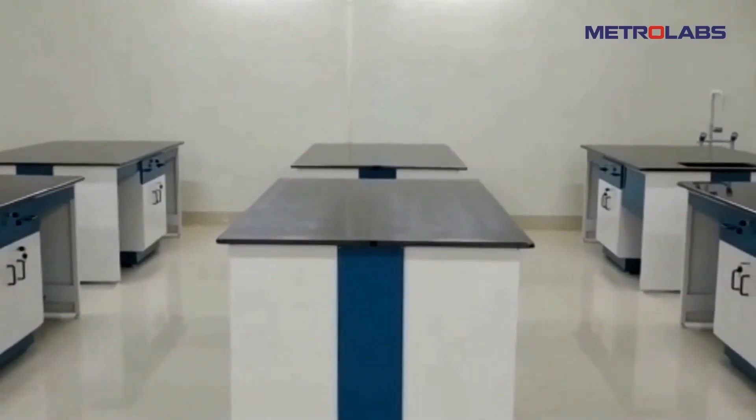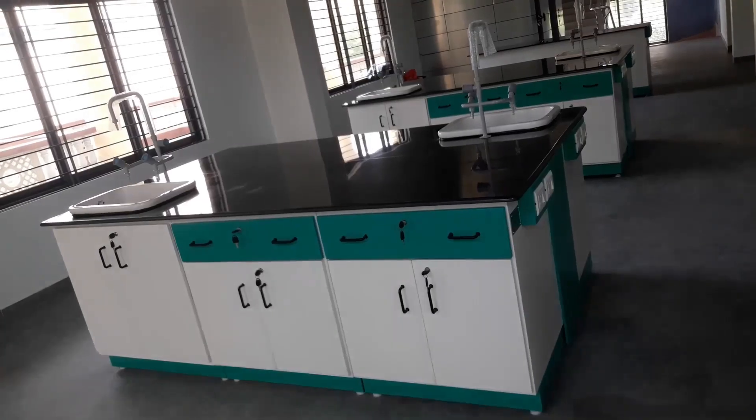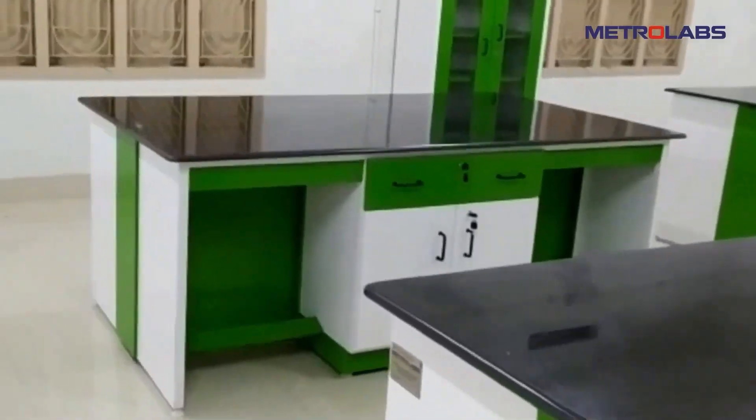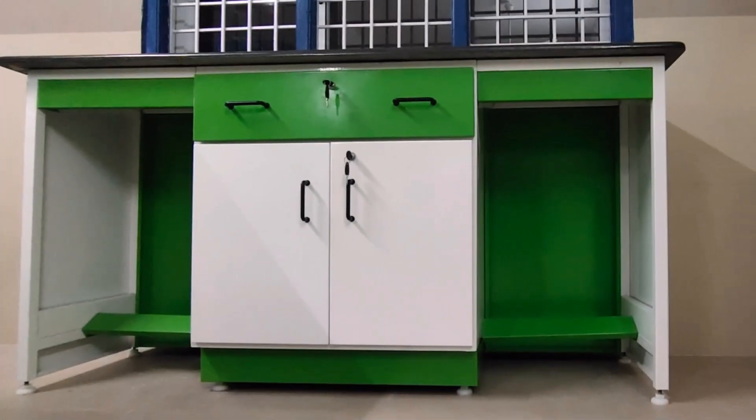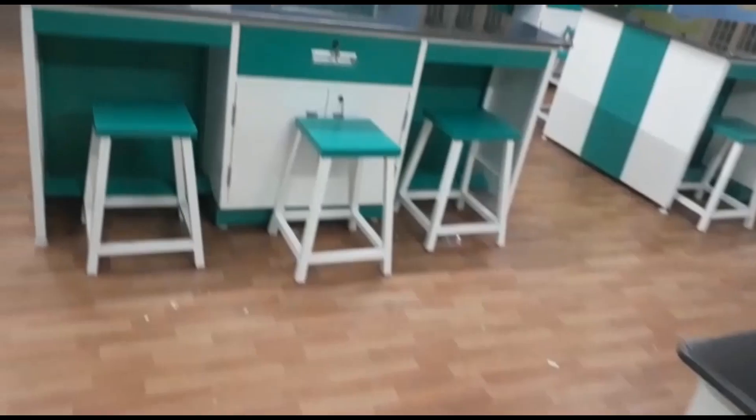These two factors will help us determine the basic layout and structure of the lab. Island work tables are preferred. Individual cupboards and drawers are provided to keep specimens, samples, and personal protective equipment. Lab tools are necessary here.